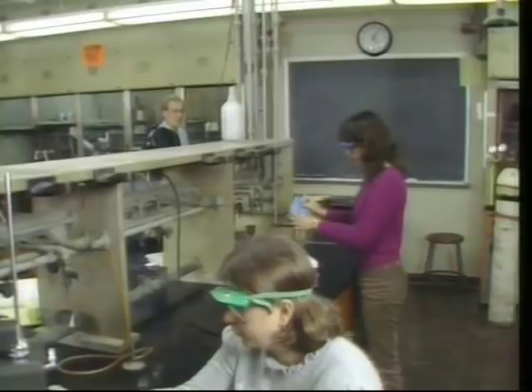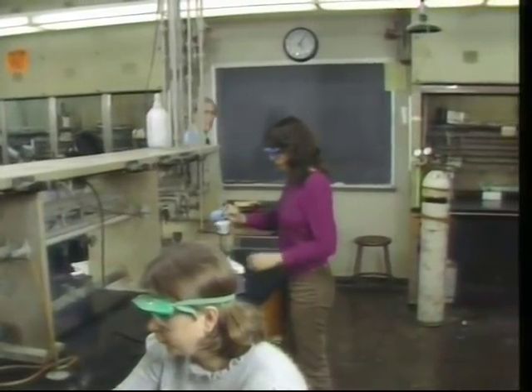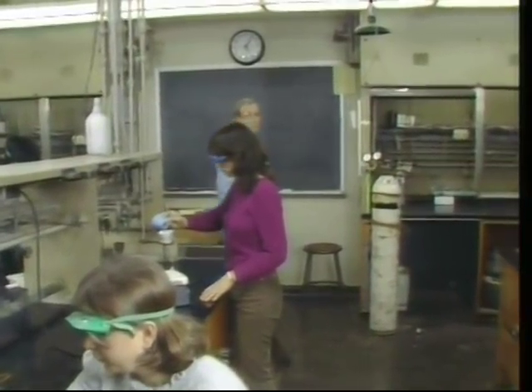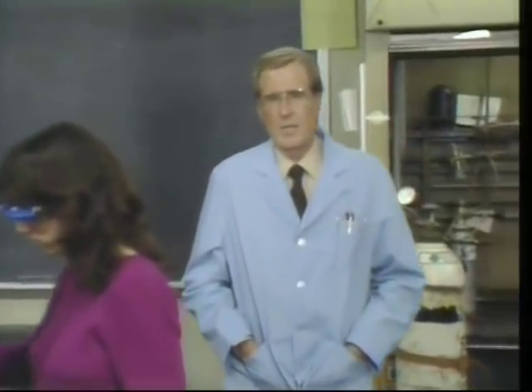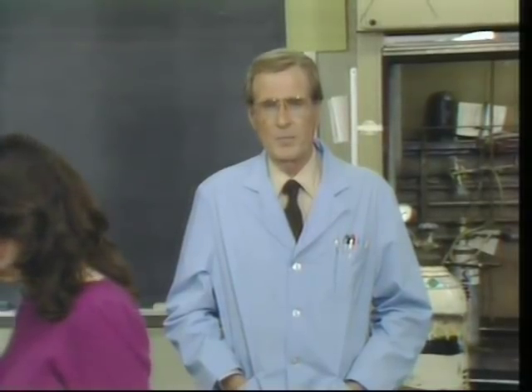Some of these are corrosive. Some are toxic or flammable. Some may emit dangerous vapors. You may be asked to work with hot materials. In every case, the important point for you to remember is that safety is everyone's responsibility.